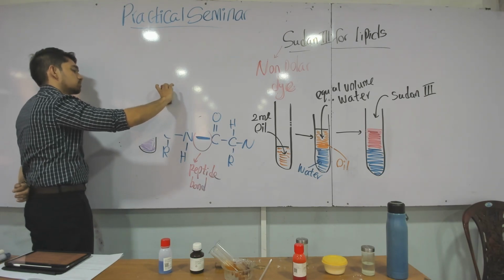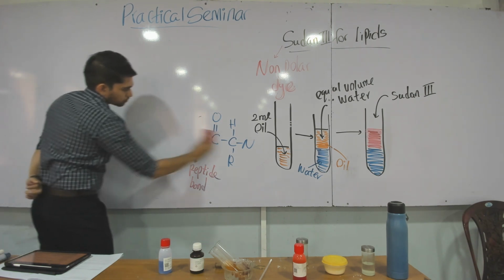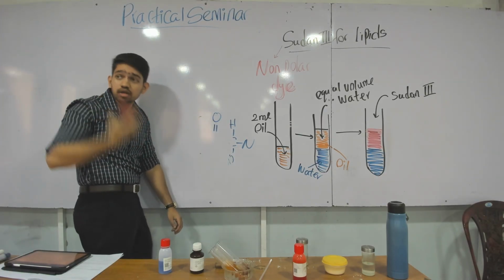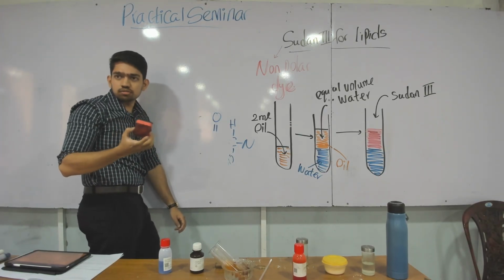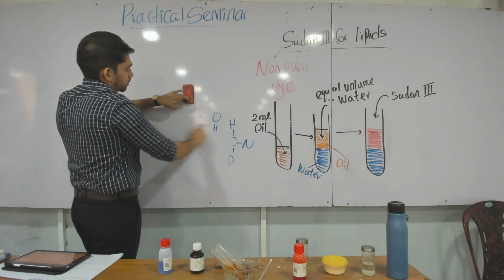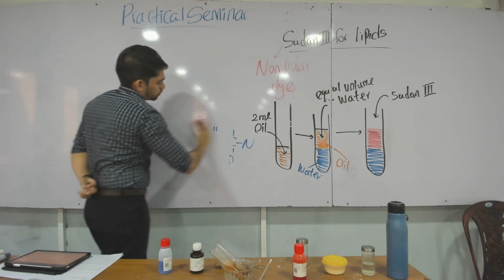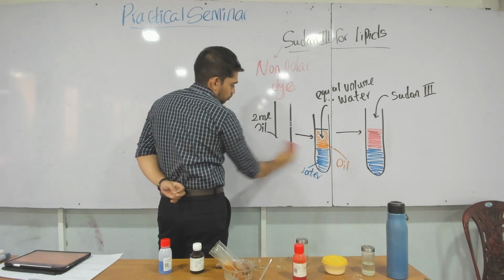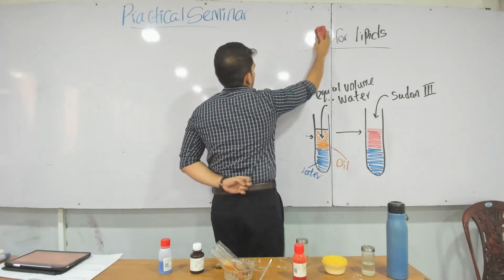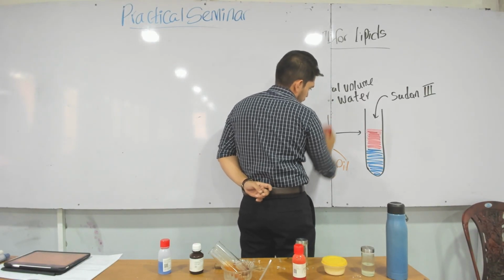They are not real. You can't project them onto a screen. So using microscopes, we create a bigger version of the object that you can see with your eyes. If I create something 10 times bigger than the object size, that is called the image, and there's an image to object ratio. That is how we measure the power of microscopes, the magnification power. This magnification power is a very important property of any microscope.